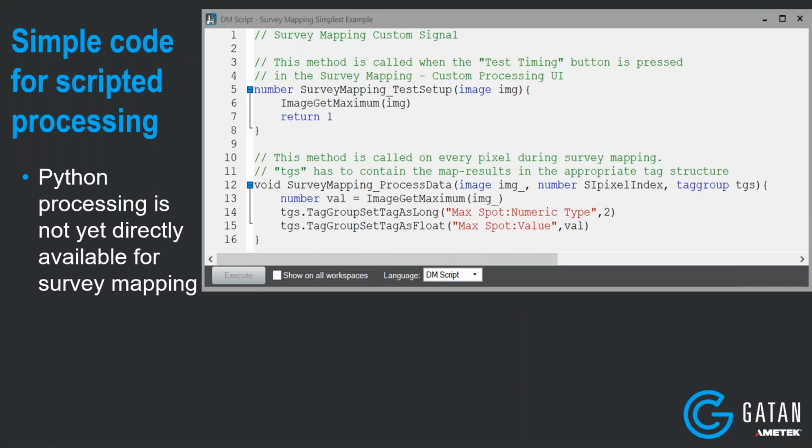So the processing that I just showed was using a script, and maybe some of you are thinking, wow, how can I do that? How can I write a script like that? This is a very simple example, a minimal example of processing data. This is not the script that I just showed applied to my data, but it's a very simple example that really does give a result in DigitalMicrograph and would work with this survey mapping tool.